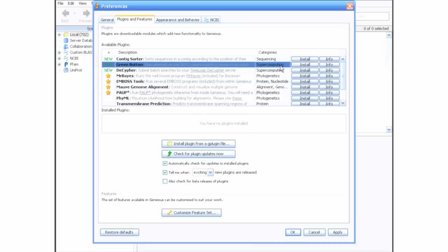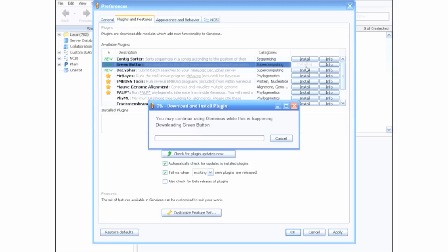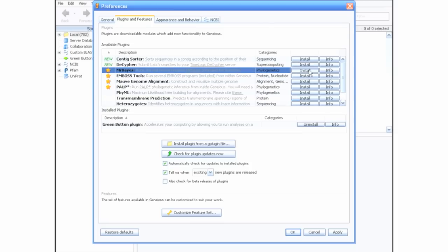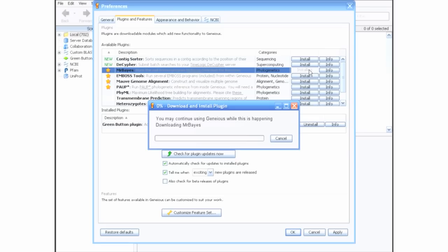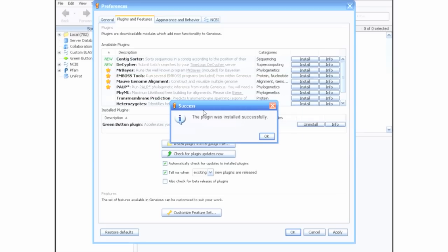Mr. Bayes is currently the only plugin supported by Green Button, but we plan to add more plugins like ClustalW in the future. Install both the Green Button and Mr. Bayes plugins and you are ready to go.